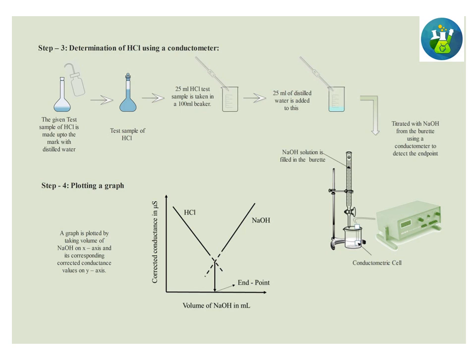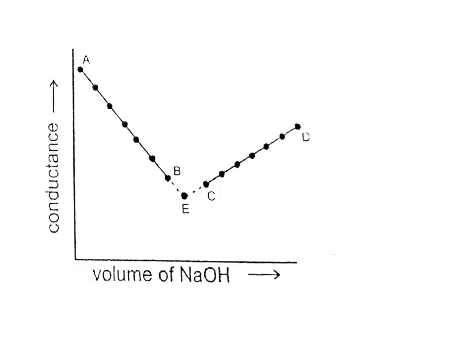Go on gradually adding 0.5 ml, but the total volume should be noted down carefully. Then you will be getting C values. Calculate C dash by using the formula C dash equals C into (V plus v) by V, and get ready with volume of base and corrected conductance values.